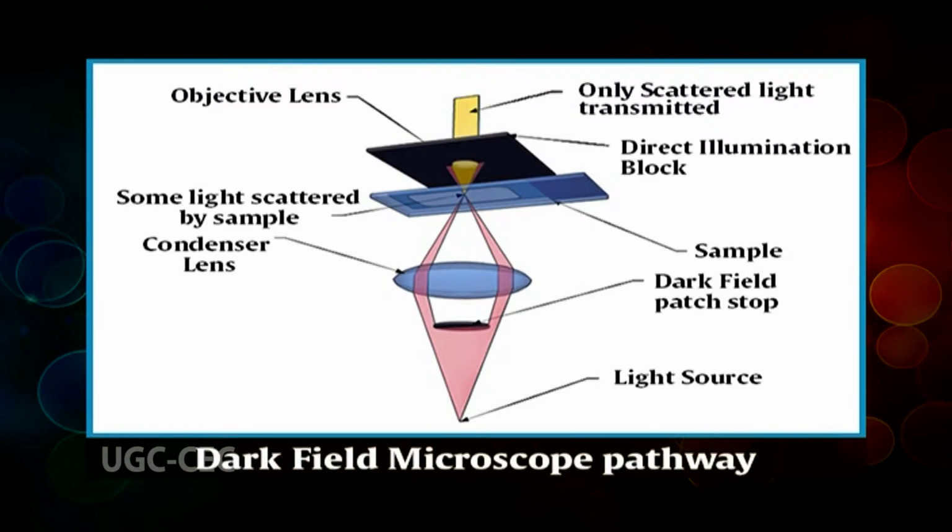It uses transmitted light to view a specimen that contains inherent contrast color or is stained. In order to get the best image possible from any transmitted light form of microscopy, it is crucial that the light path be set up properly. The method for doing this is called Köhler illumination.